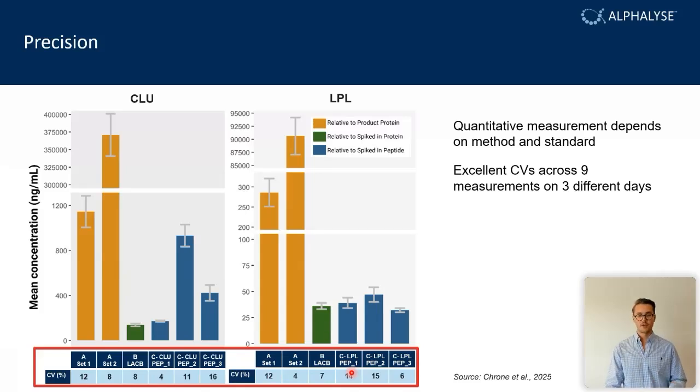The results won't vary due to instrument or analysis variability, and you'll be able to compare your results to show your process is consistent or use it for process optimization. But it also means that dependent on the reference standard or method used, you will get different results. So it's important to stick with the same one. So the results as shown here are from the untargeted approach. The targeted approach also achieved complementary results.